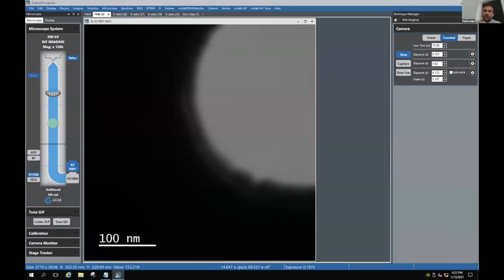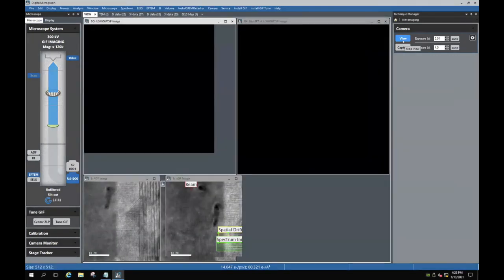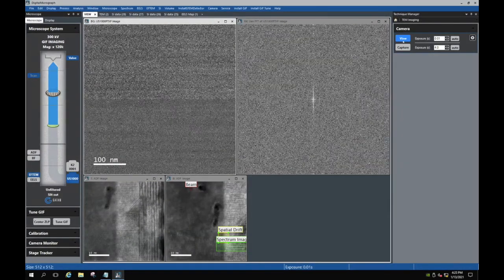So let me do the ultra scan now. You have to make sure that first of all, we have the beam on the detector. I don't know why it looks like that, because it doesn't look like that on the screen. Okay. All right, you ready? The screen.